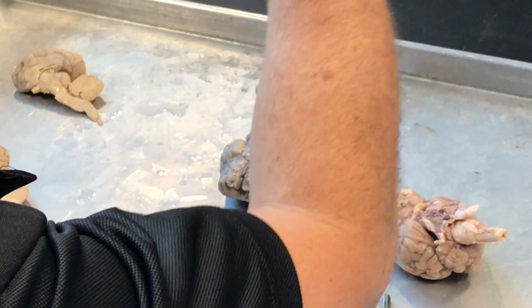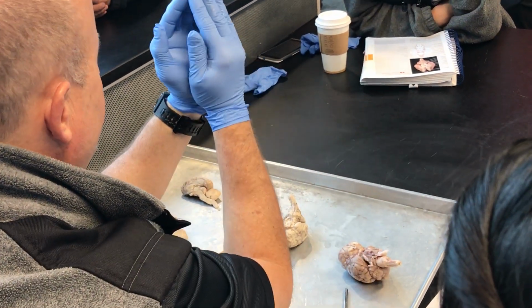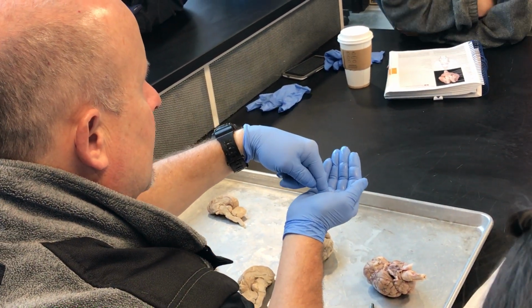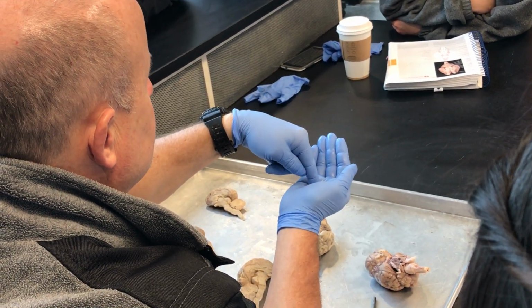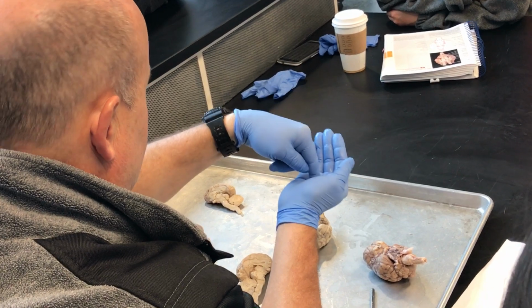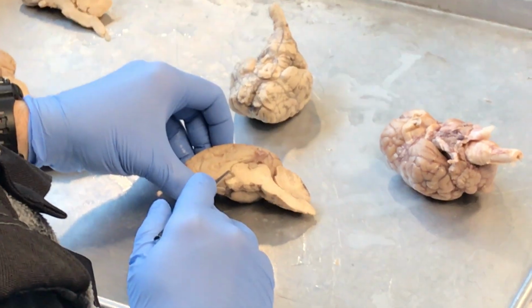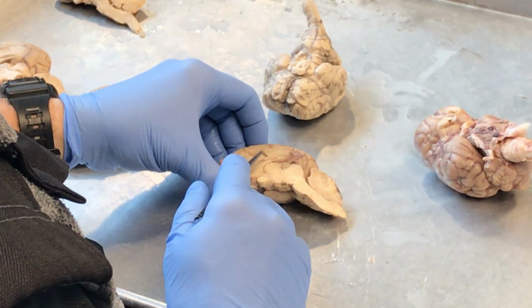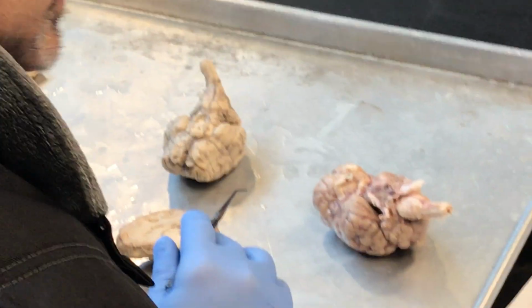So here's what we say on the test. The TAs and I will give you a leading question. Because we fold this open, if we put a pin right here and we say, what is this tissue? You say, it's hypothalamus. If we say, what ventricle is located in this location? Third ventricle. So if we put a probe right there and we say, what's that tissue? You say hypothalamus. If we say, what ventricle sets here? You would say, third ventricle. That's 1, 2, 3. There are 4 total. We'll talk about the next one in just a minute.